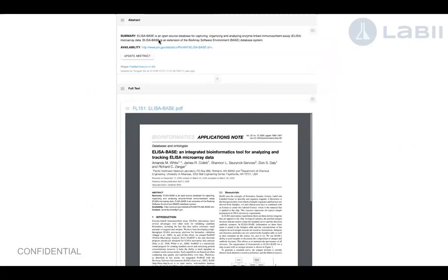And moving on, this is the section view of this paper. You're able to see the summaries and all different kinds of things. And of course, for this summary, you only need one button and just click it. If you are not seeing the summary, whenever you click it, it can download it directly. Actually, it can detect the PMID column and then use the PMID to download the abstract. And next to it is the full text. You can attach any PDF files or any different things.